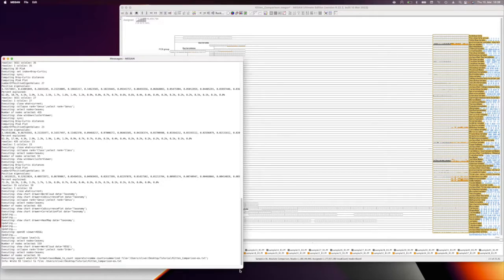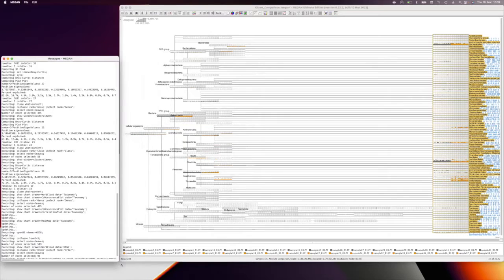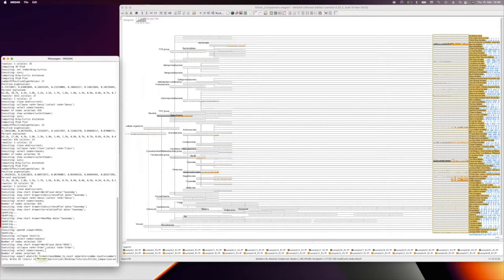Now we can use this to write a script that will basically export our data. And this is what I'd like to show you very briefly now. In my work, I use those scripts quite regularly to export data.